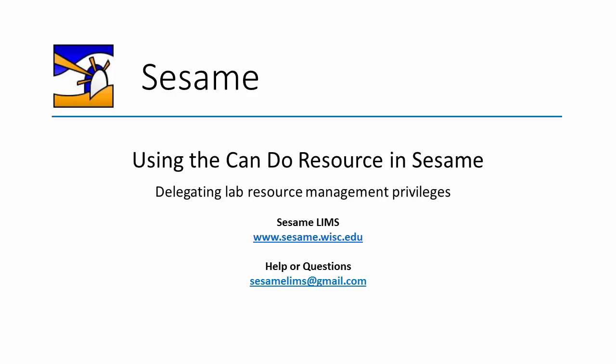Hello, and welcome to this video tutorial about using the Can Do resource in Sesame. For this tutorial, we will use the Scheherazade module.